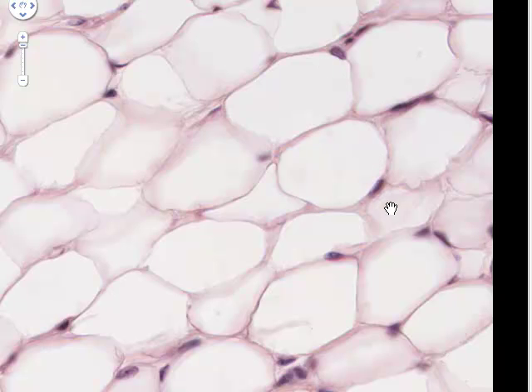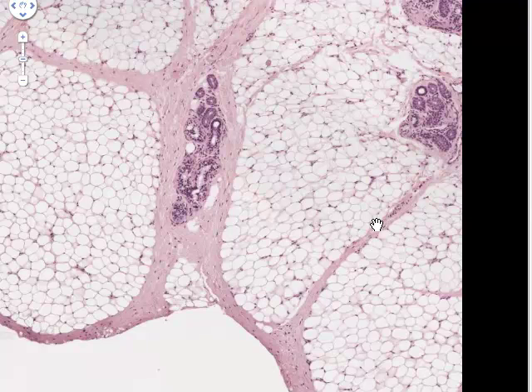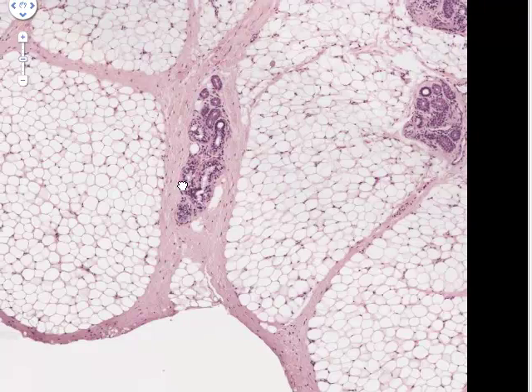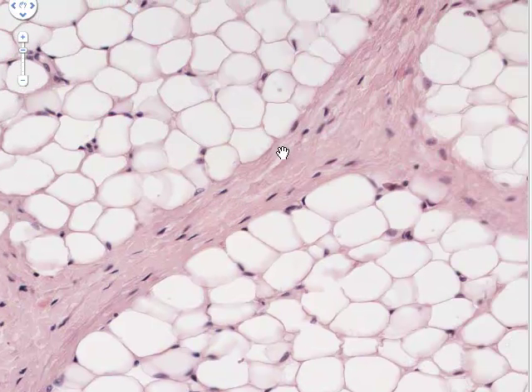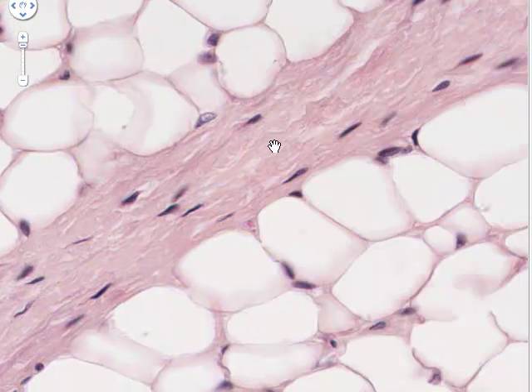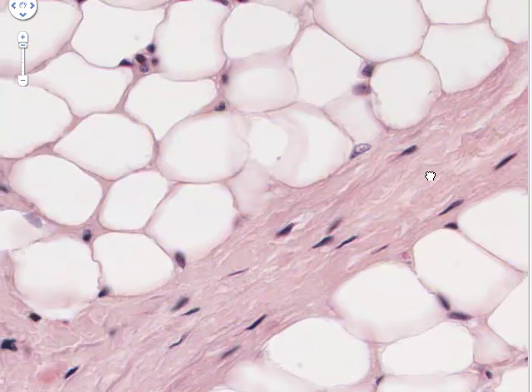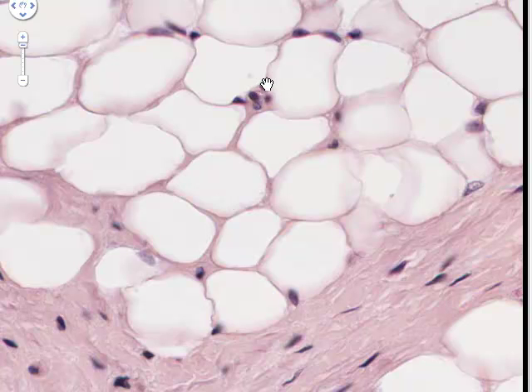Here's another adipocyte with its nucleus, and this is where its fat droplet would have been. Zooming out slightly, we can see these cells are bound together in clusters by sheets of pink material — moderately dense collagenous connective tissue. The nuclei within that connective tissue belong to fibroblasts. Zooming in further, we can see the bundling of collagen fibres. Among the adipocytes there are also other nuclei — some belonging to endothelial cells of capillaries, and some to fibroblasts interspersed among the adipocytes.